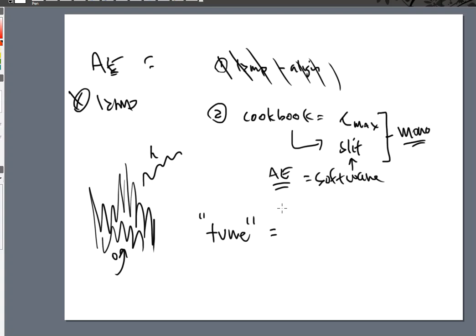We want it to see sodium and sodium only, but we have a really wide window of concentrations that we've made with our standards. So this is going to tell you that up front, you're going to start with your 100 ppm standard. And that 100 ppm standard is going to be used to tune or set the instrument. And what it does is that it sets that to be a 1 absorbance.